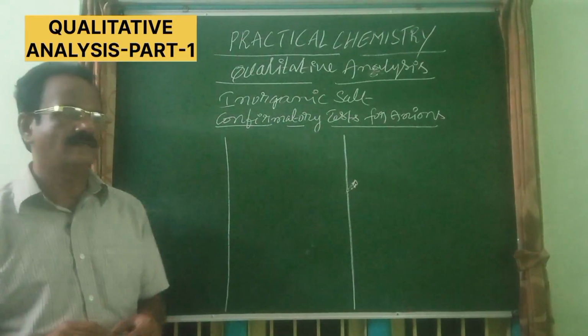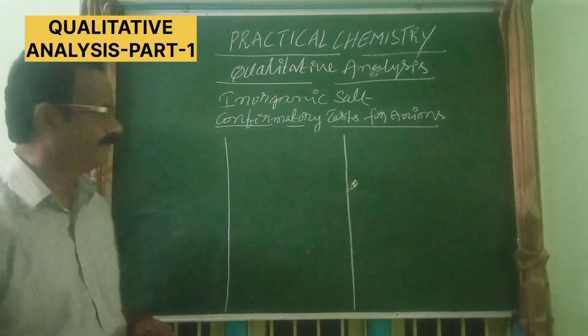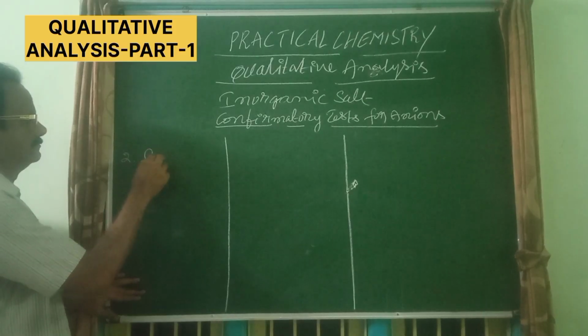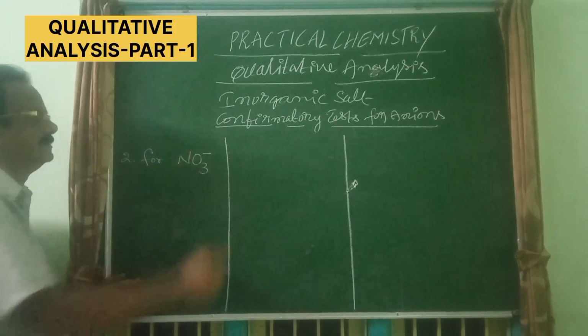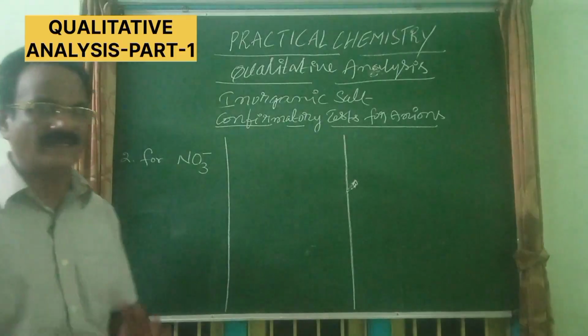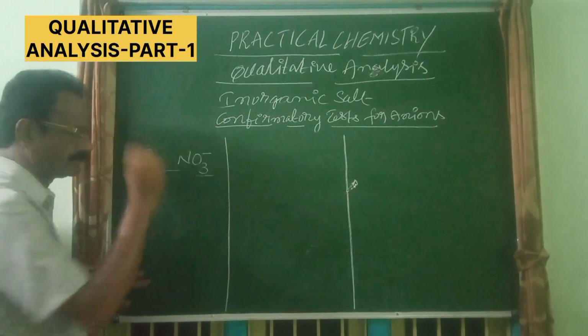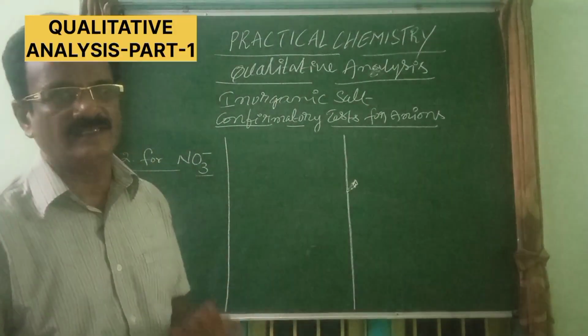Let us see the confirmatory test for nitrate. Confirmatory test for nitrate. See here. Here also the extract is to be taken in the test tube.